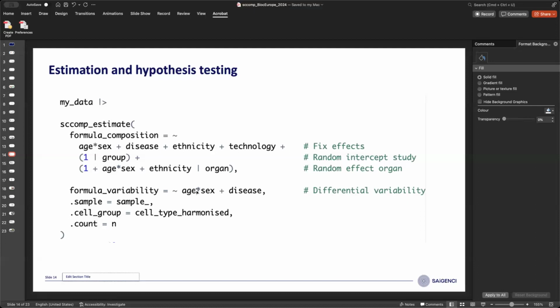Here, you're not assuming that there's any interaction between sex and disease either. Not in this model. It's a good question up to when the model should be complex. We decided to stop at the things we felt were most associated, but definitely.